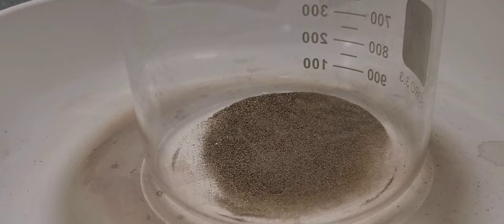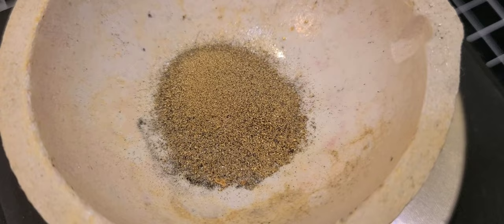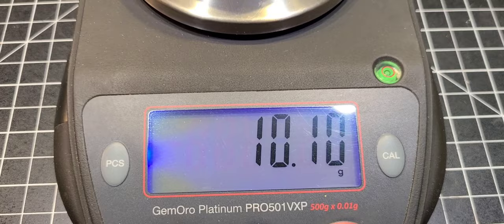I decanted that off, and I'm drying it right in the same beaker here. You can still see there's quite a bit of black sands in there. They're heavy though — I couldn't pan them out as easy as I thought it was going to be. So I've got it all dry and I'm going to weigh it up here. I think it ends up being about 10 grams. Look at all that — there's a lot of visible stuff in there that needs to come out. We've got about 10.1 grams of material.